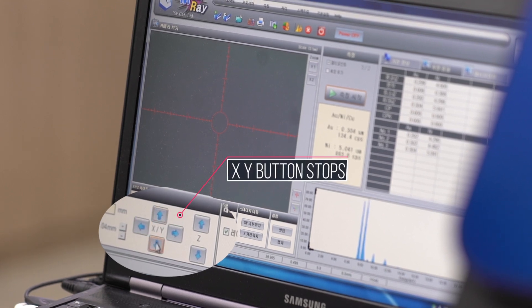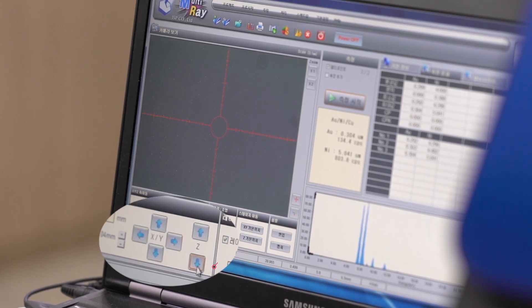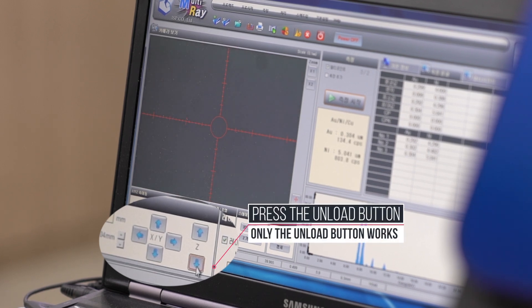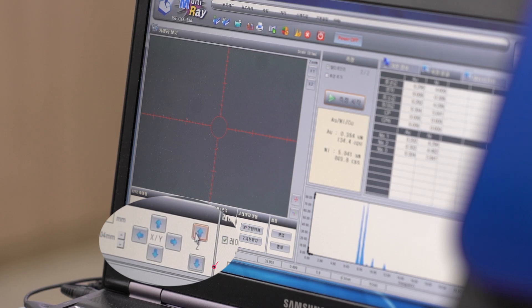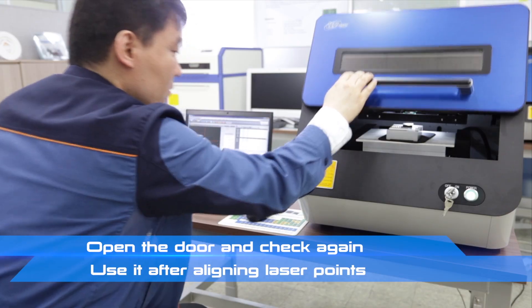If the sample is interrupted, the buttons will stop. Only the down button will work. After lowering the stage, open the door and check with your eyes.